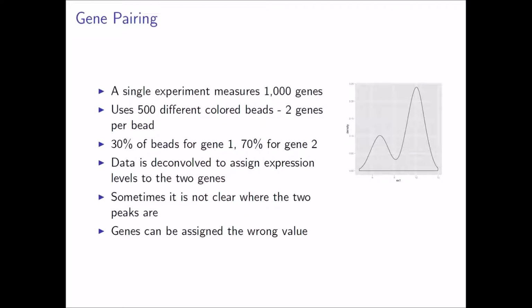I believe the idea was to pick two genes that are separated enough in expression levels that they would be easy to deconvolve once these beads get measured.